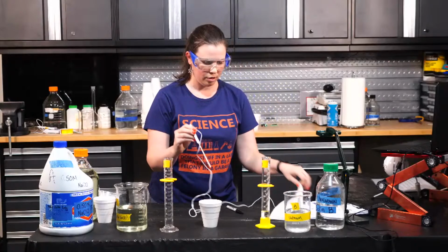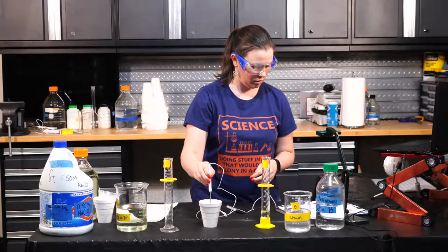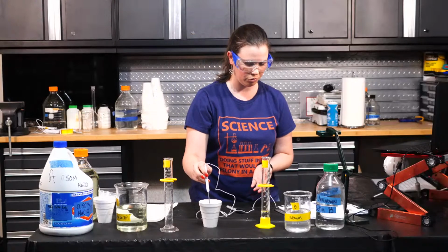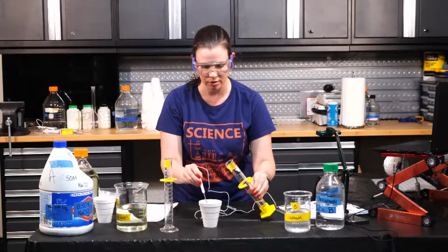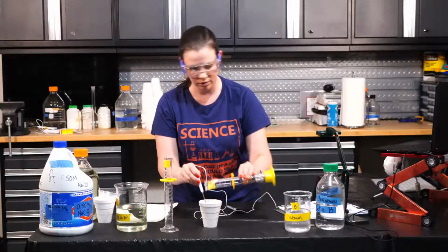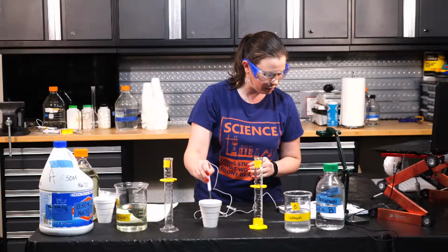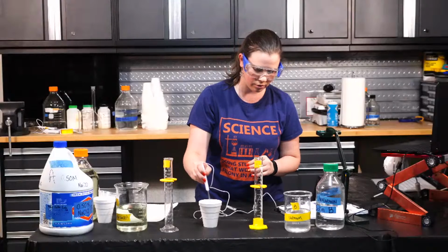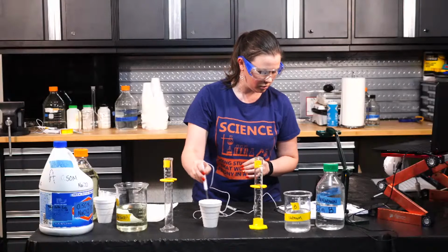And I'm going to get the initial temperature of the mixture here. And big surprise, we are at 19.0, the same initial temperature from before. So now I'm going to add solution B and see what the temperature change might be. All right, give it a little stir. 29.7, 29.8, 29.9, 30.0, 30.0. Still 30.0.